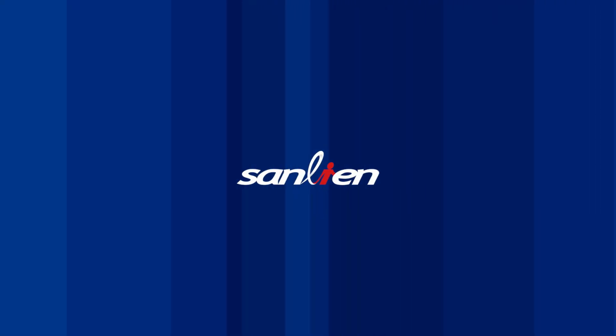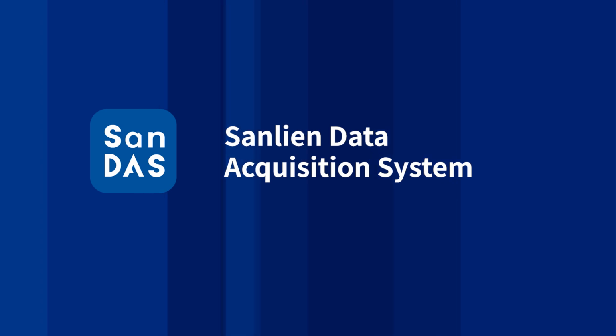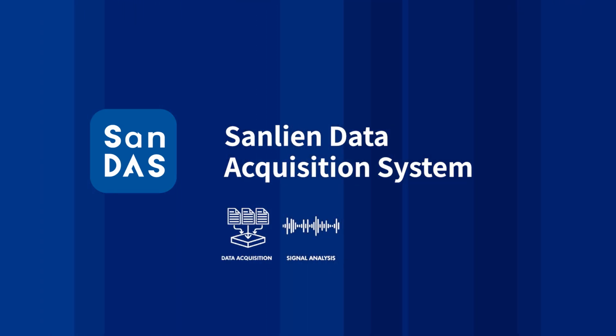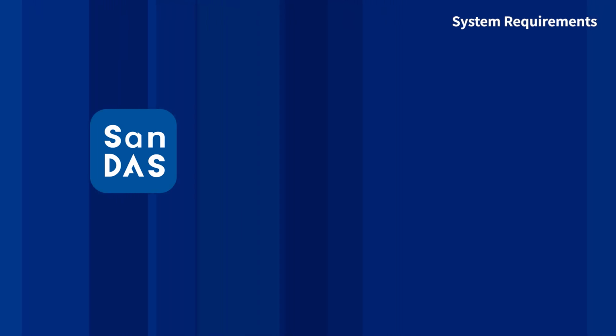Hello everyone, today we're here to introduce the Sanlien Data Acquisition System, also known as SanDAS. SanDAS is a cross-platform desktop application designed for instrument configuration, data acquisition from most of the standard Sanlien instruments, and offline event data analysis. Before we proceed, let's go over the system requirements for SanDAS.